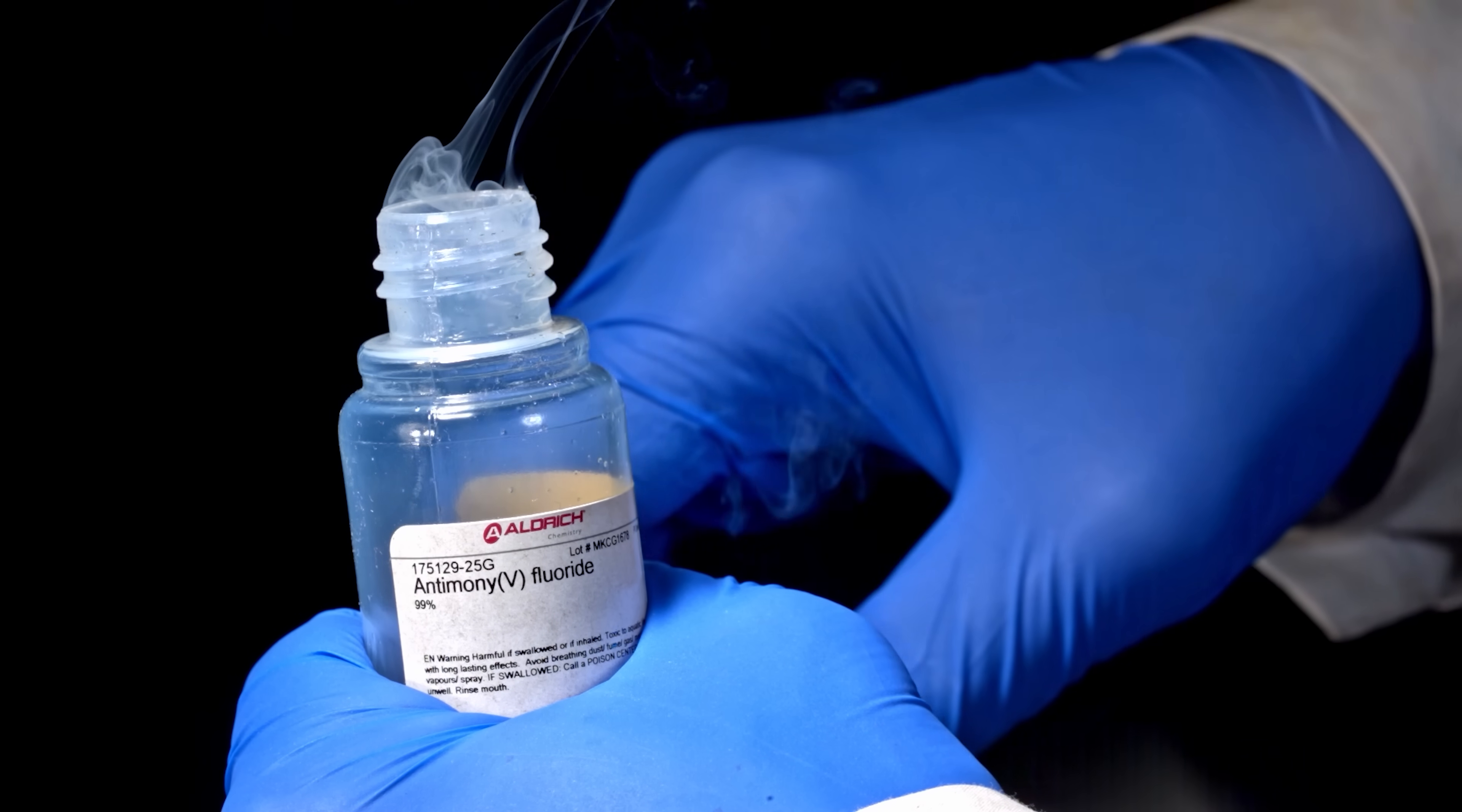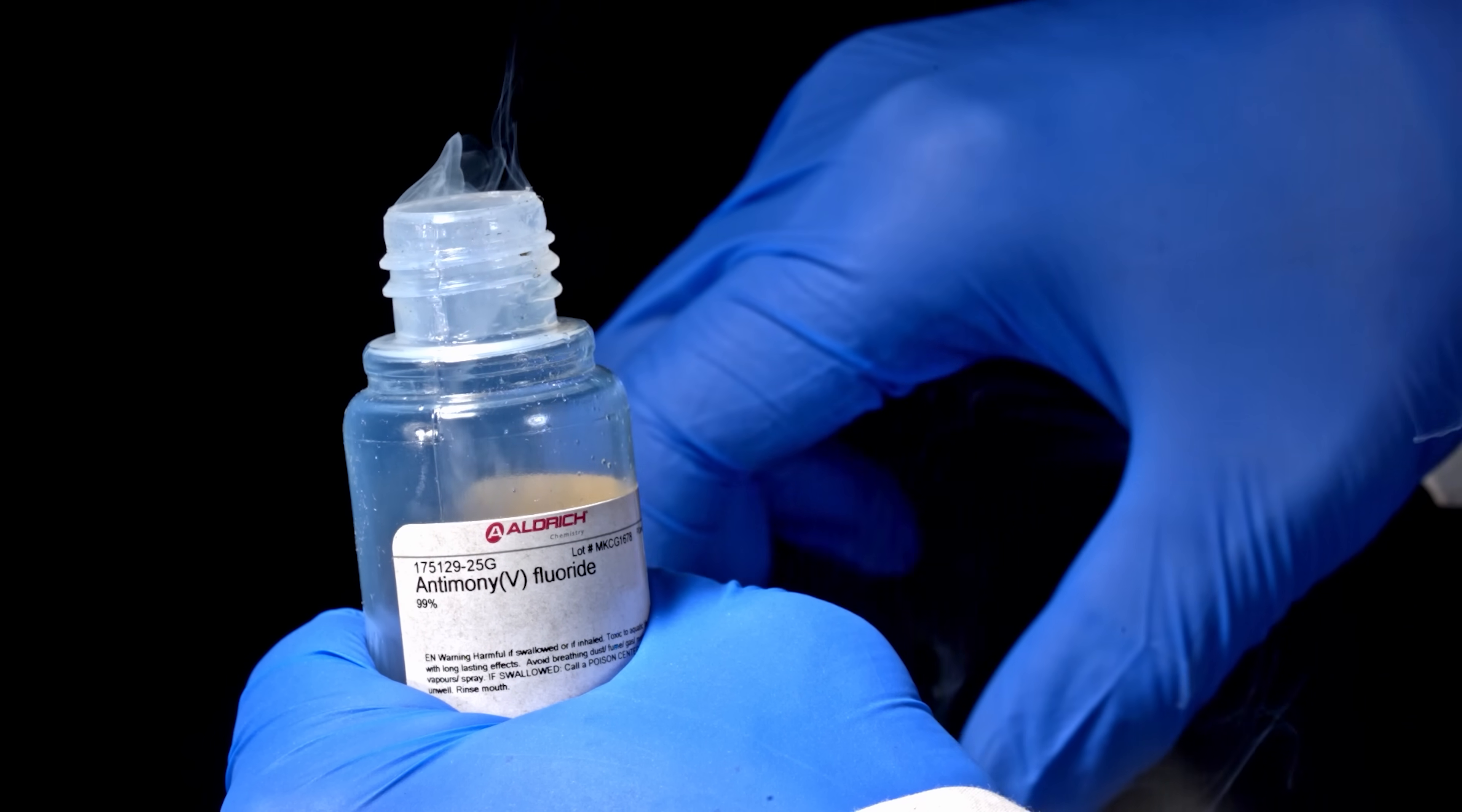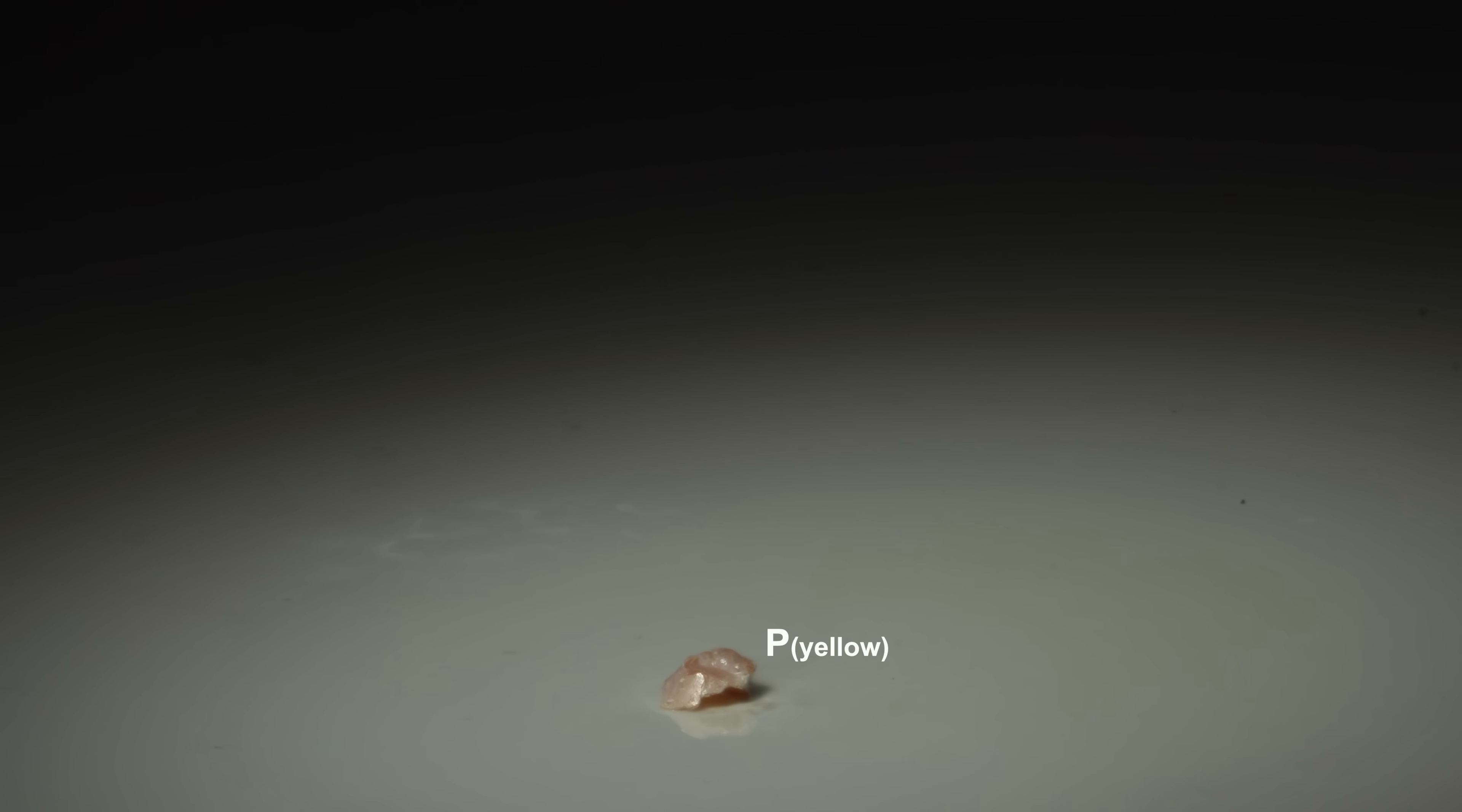So, antimony pentafluoride is a vigorous oxidizer and fluorinating agent. Phosphorus burns on contact with it.